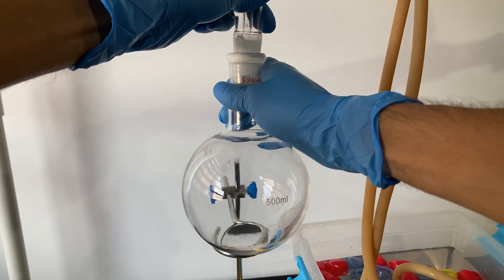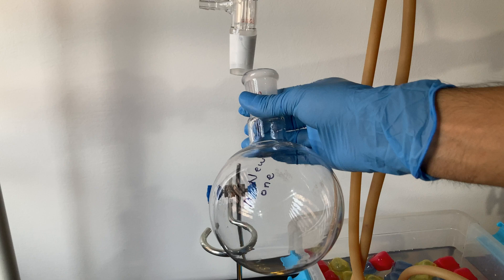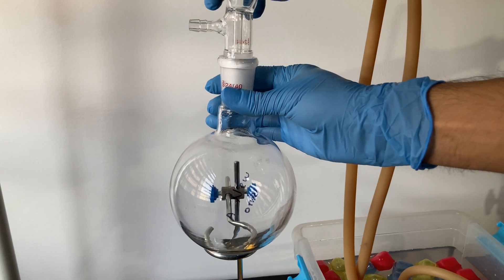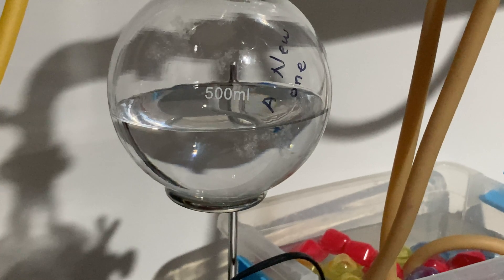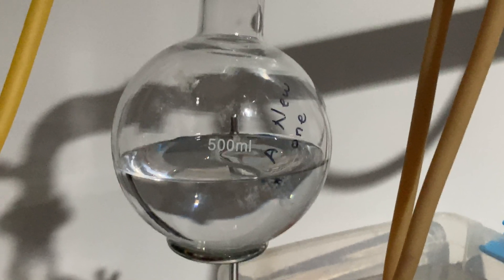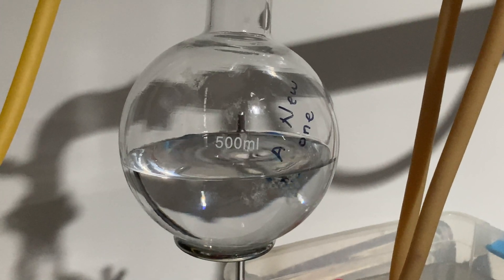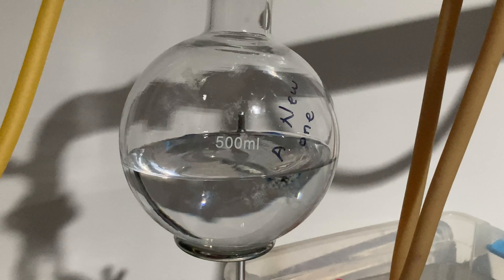Going back to my distillation, I collected a handful of milliliters before changing the collection flask for a new one. I was able to collect about 400 milliliters of azeotropic ethanol at a concentration of around 96%. But what is an azeotrope, and why do water and ethanol form one?